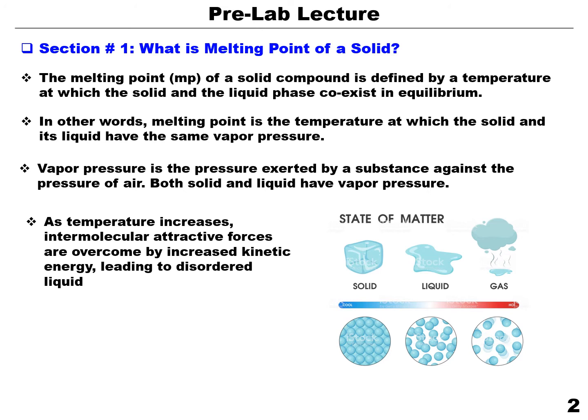So to talk about melting point, our sample for sure will be a solid, and when you apply a temperature to a solid, the intermolecular attractive forces tend to loosen and be disturbed until each molecule of the solid moves randomly, and the overall system becomes more disordered.